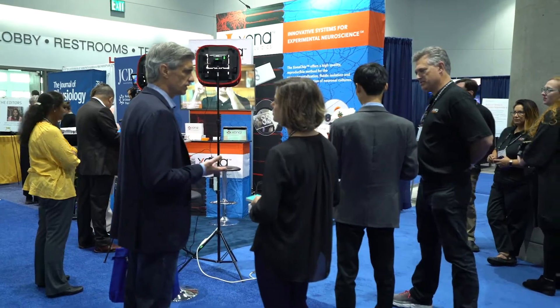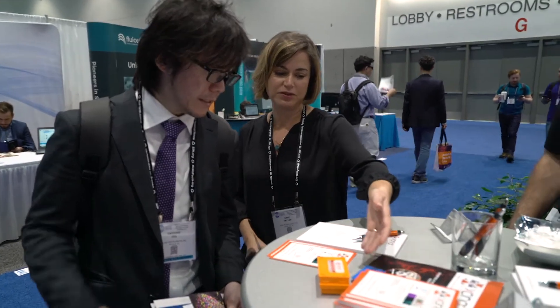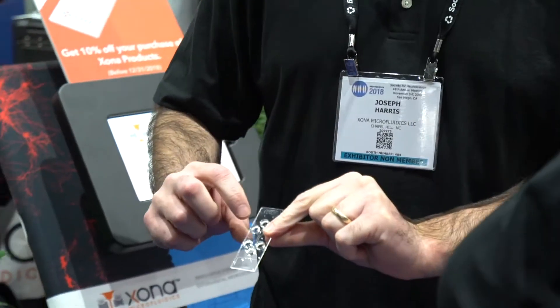We're here in sunny San Diego at the Society for Neuroscience 2018 convention and we are happy to be launching a new product called the XonaChips.